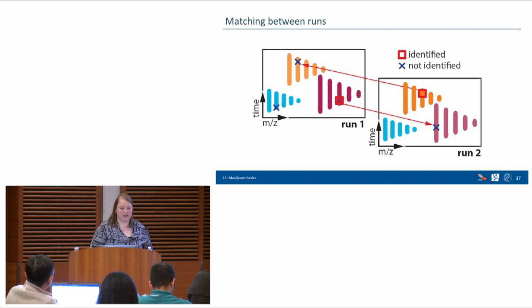Also, what one has to see here is that match between runs you should apply between similar data.